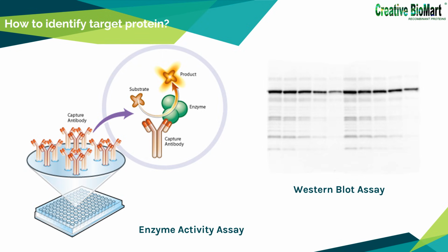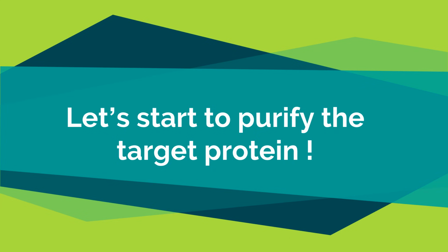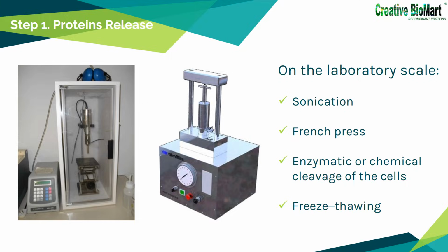These methods will be used after the purification process. We'll talk about this later. When you know how to analyze whether your purification process is successful, we can start to purify the protein now. First, the protein needs to be released from the cell.